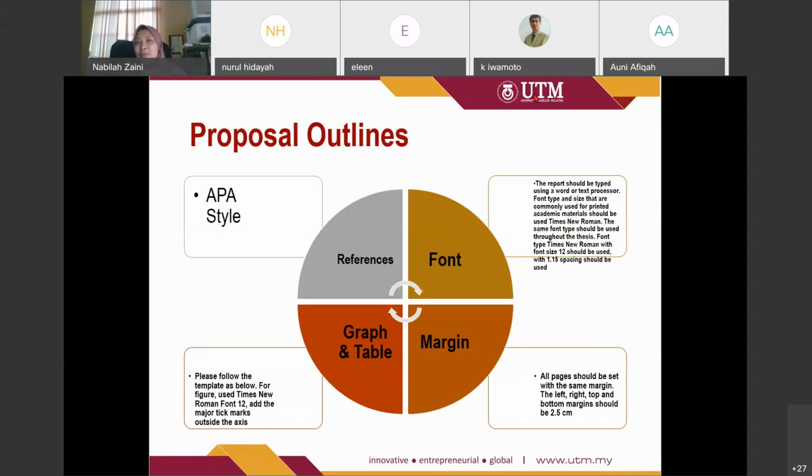If you can, list as many solid organic compounds as possible that have a melting and boiling point less than 200 degrees C. Then during the presentation we can help you decide on the selection of organic compound.